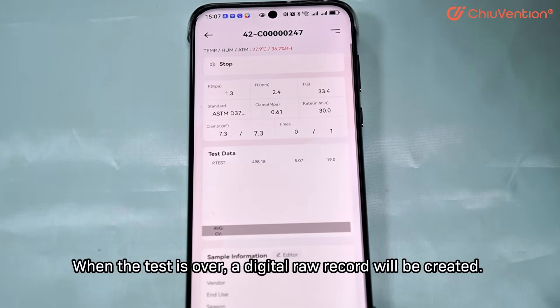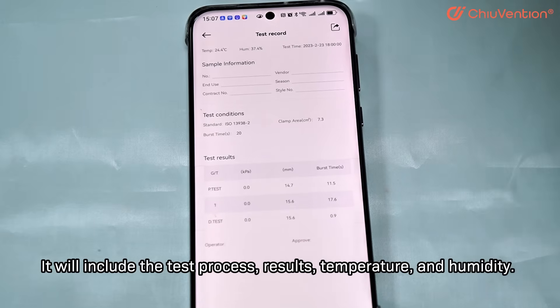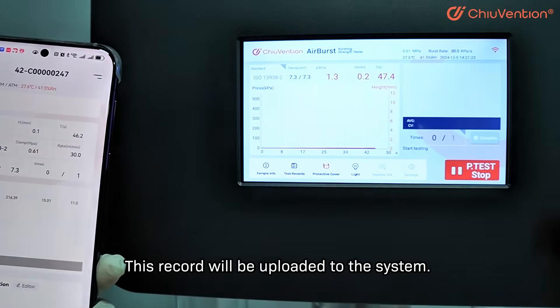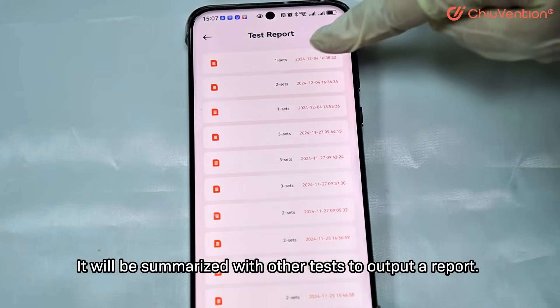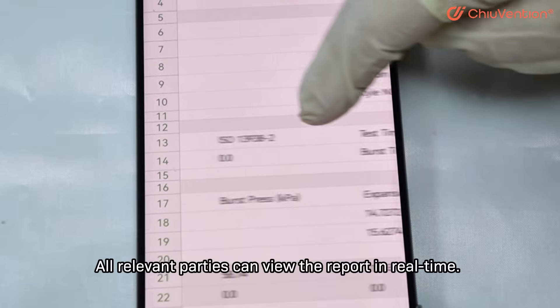When the test is over, a digital raw record will be created. It will include the test process, results, temperature, and humidity. This record will be uploaded to the system, summarized with other tests to output a report. All relevant parties can view the report in real time.